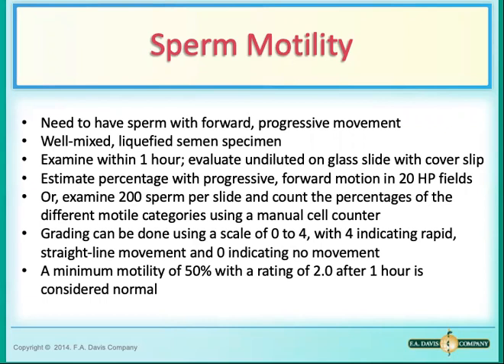Okay, so you will use a well-mixed sample. It has to be liquefied within 1 hour of specimen collection. You can also perform this test at timed intervals over an extended period of time. You can look at the motility in a drop of specimen on a microscope slide. You would put a cover slip on top of it, and then you look at it under the microscope and make sure that you allow 1 minute for those cells to settle, and then you evaluate the motility.